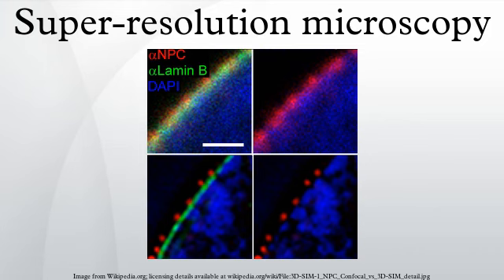The photons emitted during the fluorescent phase are collected with a camera and the resulting image of the fluorophore can be fitted with very high precision, even on the order of a few angstroms. Repeating the process several thousand times ensures that all fluorophores can go through the bright state and are recorded. A computer then reconstructs a super-resolved image.